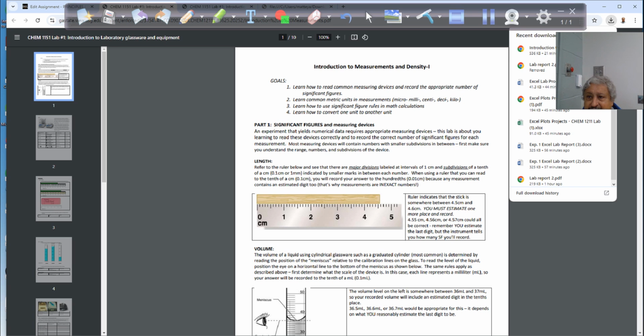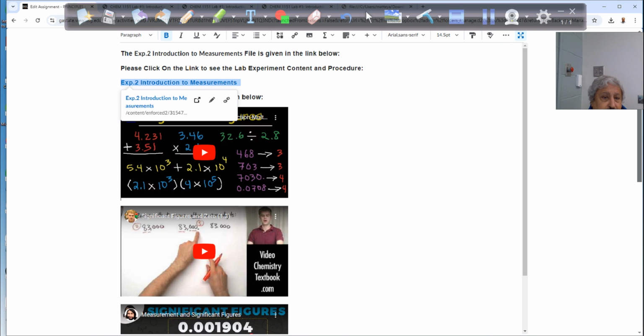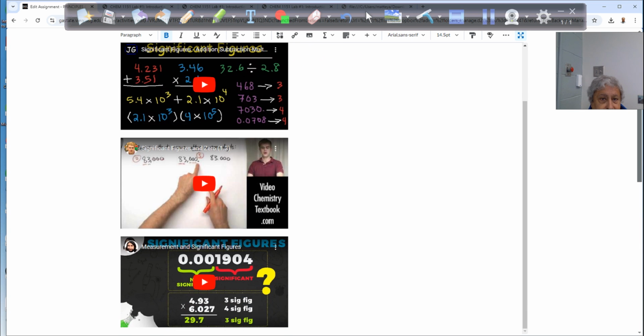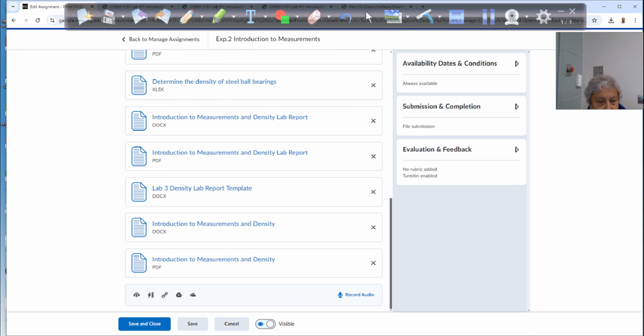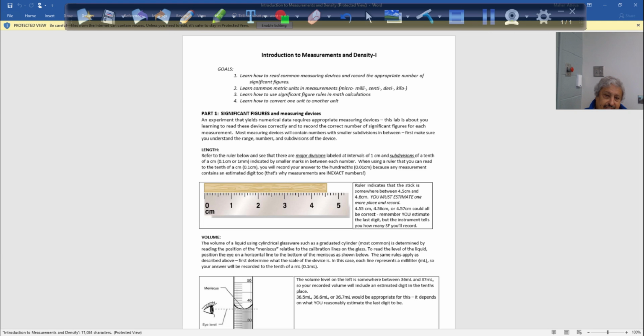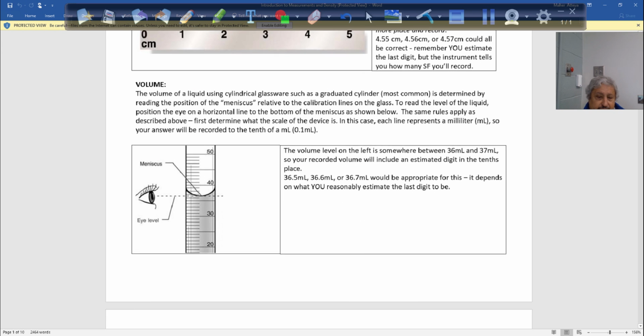Yeah, download. I did. It's in the iCollege. Where is it? It's the middle one from the bottom. Here it is. I put it yesterday. I forgot I put this one down. Okay, guys, here it is. That's much better. So we have a slider here, a ruler, then make it bigger.